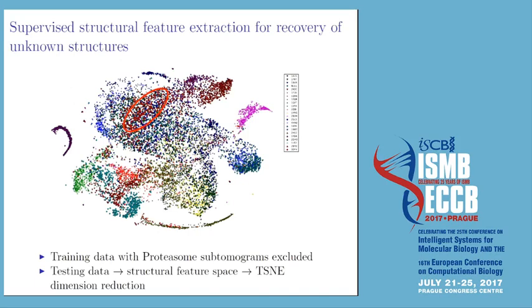In such a case, if we over-partition these test samples using clustering, we are able to obtain clusters where this proteasome is highly enriched. And by applying our previously developed unsupervised classification and averaging techniques, we may expect to recover the structure of this proteasome, even if it does not exist in our training data.